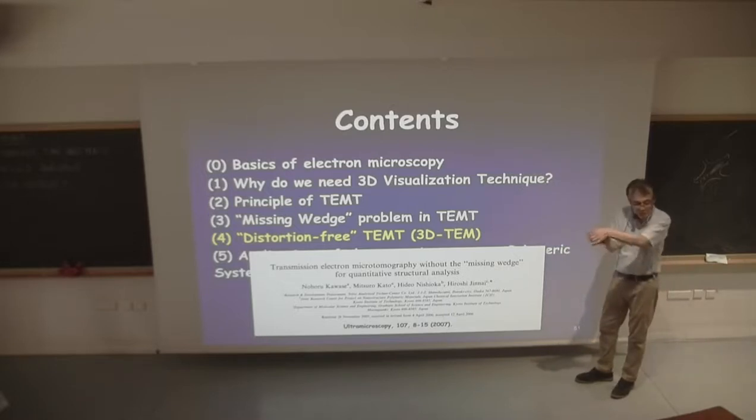To make this rod sample cannot be done. I mean, maybe it can be done, but it's very difficult using microtoming. You have to cut it once and then cut it twice, right? You cut the sample to make a planar sample, and then you have to cut it again. But that's very tedious. We have done that, but only a few students can do it.